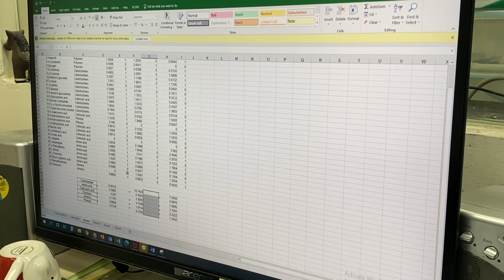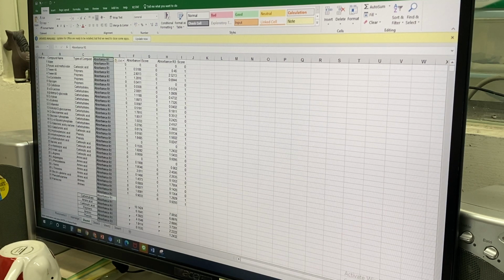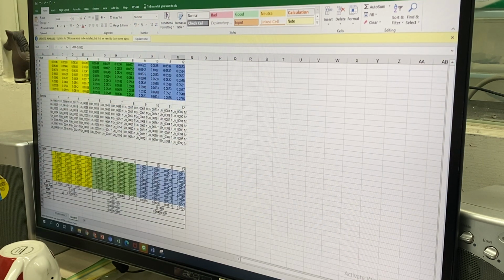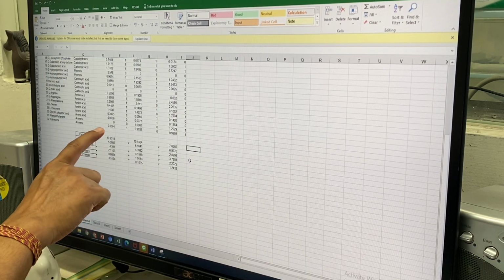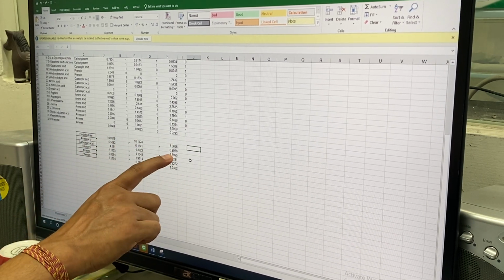Delete. So this is the absorbance 1 carbohydrate value. Absorbance 2, you can see. Yeah, I know. So you have to arrange the mean value over here. You arrange the mean value and ST value. So you have to score again, the mean value. So this is absorbance 1, absorbance 2, absorbance 3. Replica 1, replica 2, replica 3, right?